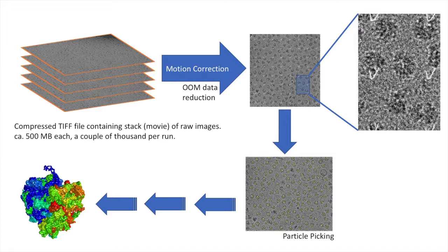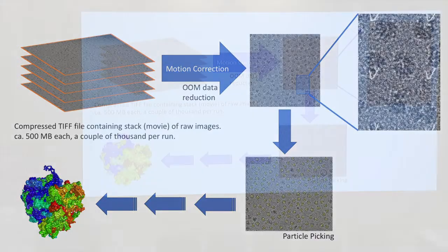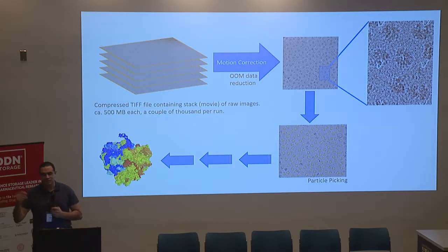And so we really need to keep all this raw data, because people are coming back and realigning and reprocessing and finding that they can get much better data. So in terms of what we do for management, Jason will talk a bit more about it. I'm mildly involved in it because it lands on my workstations, and I've screwed things up, and Jason has saved me, and so he'll tell you more about how we handle our data. But that's what CryoEM is, and thanks a lot.